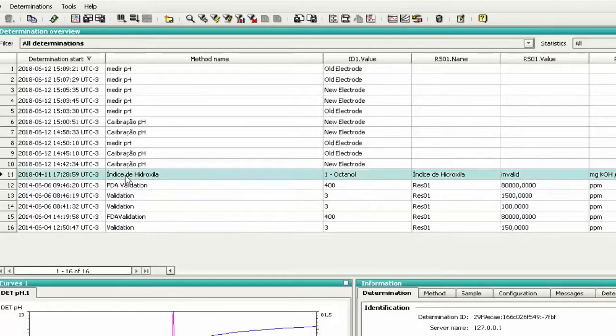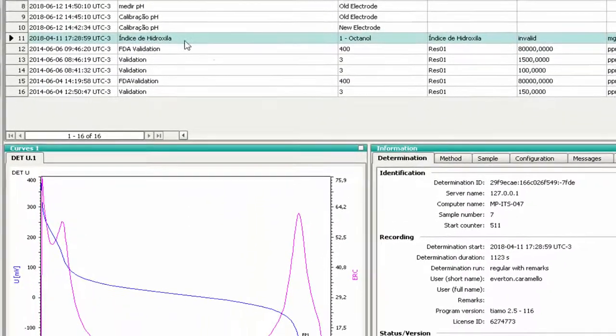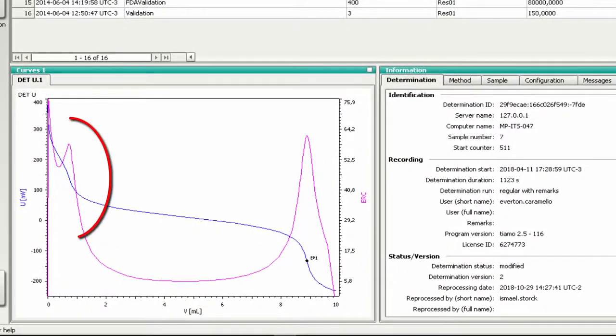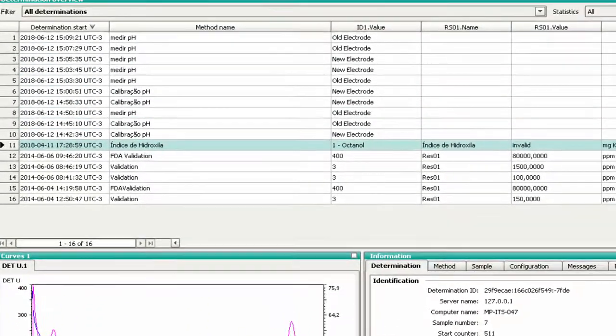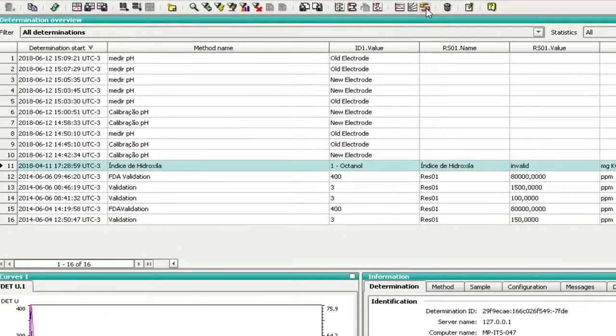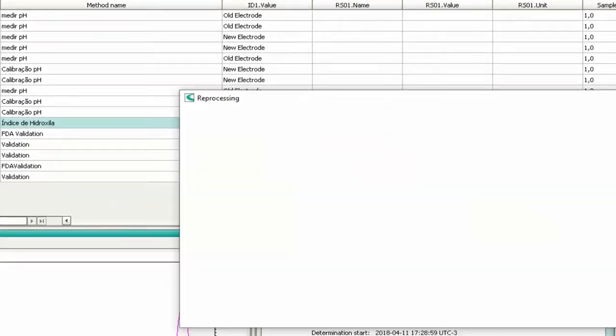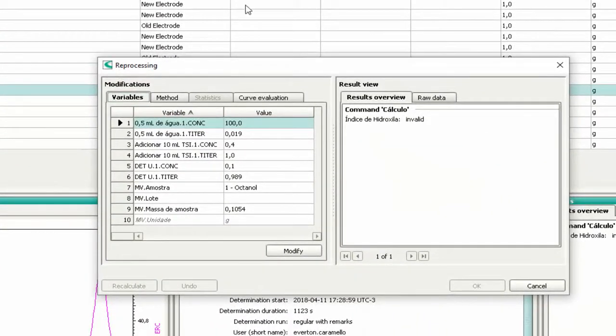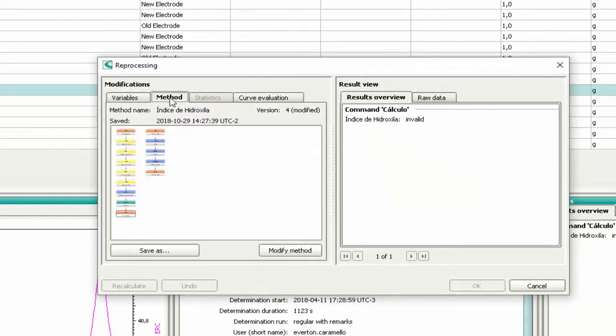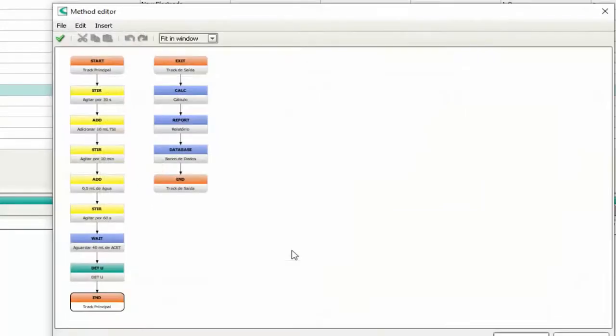If we have an analysis with EP recognition problems, we have to change the method. Select the method tab, press the button 'Modify method', and double-click on the green titration command.